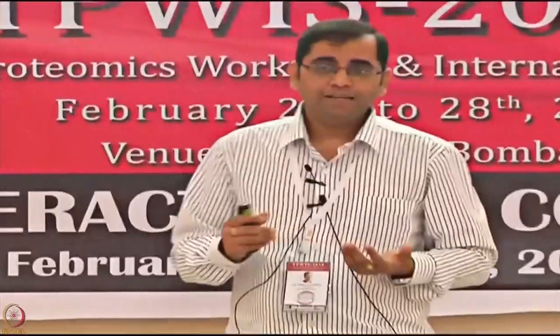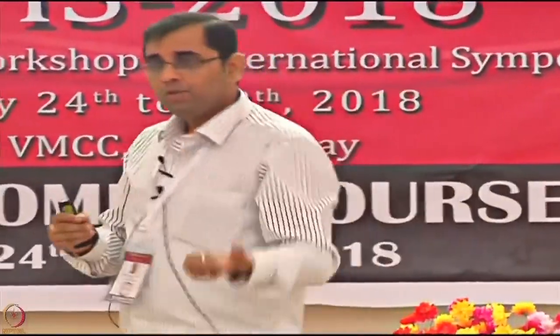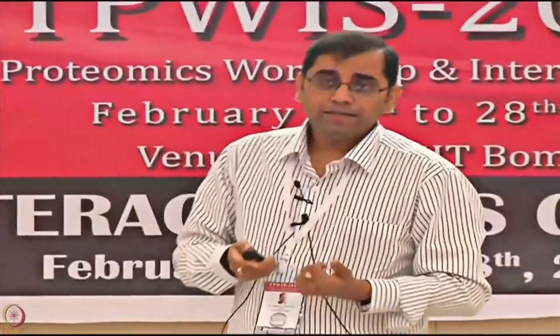In this case, if binding is not working, you'll watch for just 20 minutes, stop it, and now you'll bring a new solution, change the concentration, change the temperature, do different pH scouting. So you have many ways of planning to modulate the experiment. You're not going to just wait 10 hours for something to happen and then say that, okay, it's happened or not happened. More importantly, in the case of microarray or other label-based platforms, you are only measuring the signal at the end, which gives you an idea whether it happened or did not happen. So you have a positive signal or a negative signal.